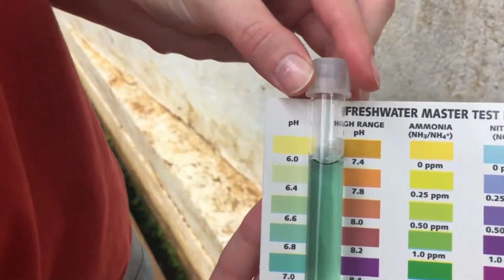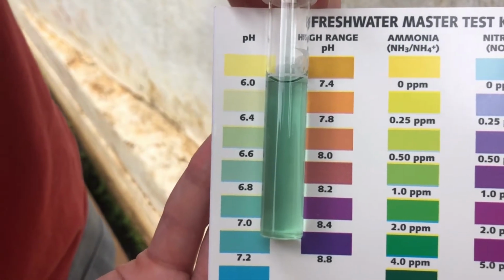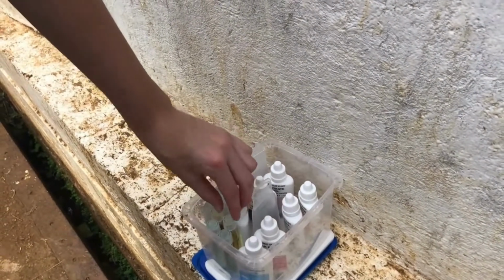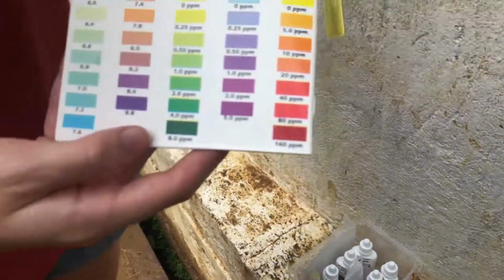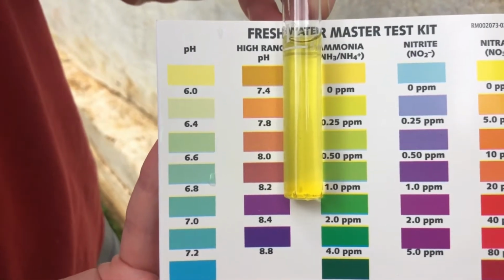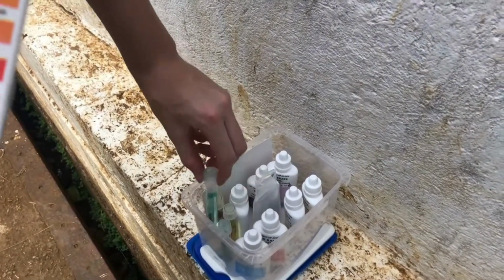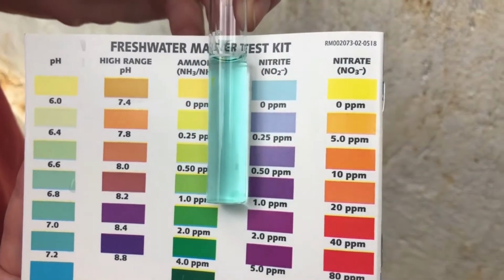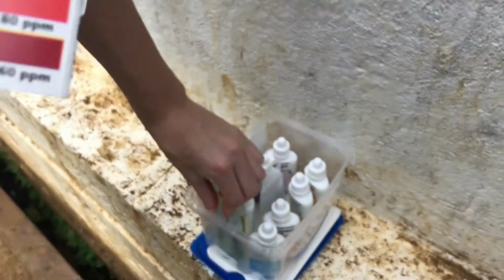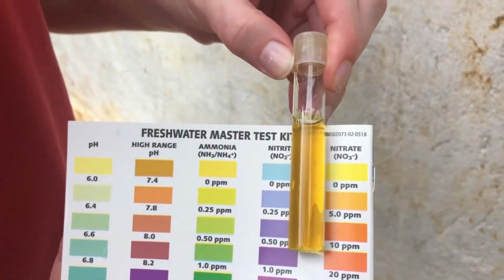Place it on the white part of the chart next to the respective column. Test 1 looks about a 6.8 pH. Test 2 for ammonia gives us 0.25 parts per million. Test 3 for nitrite gives us 0 parts per million. And test 4 for nitrate gives us 5 parts per million.